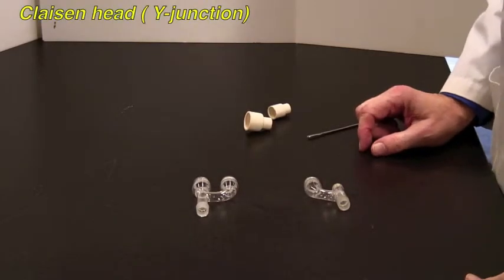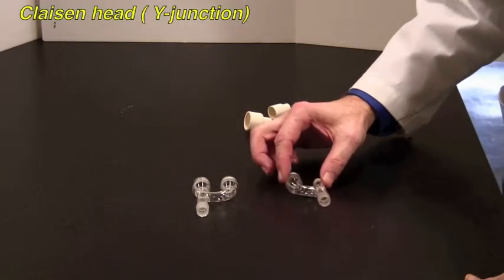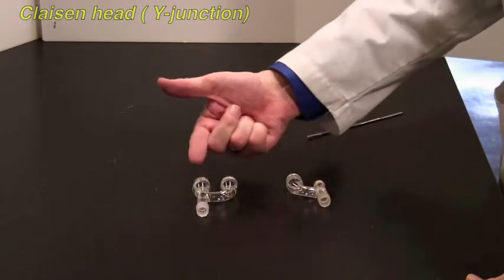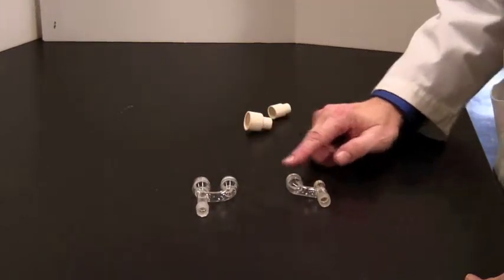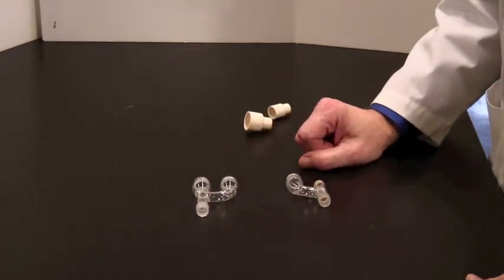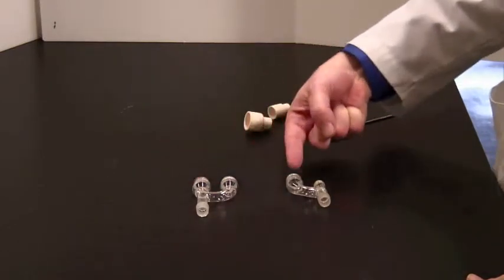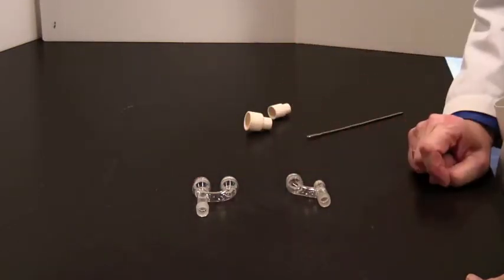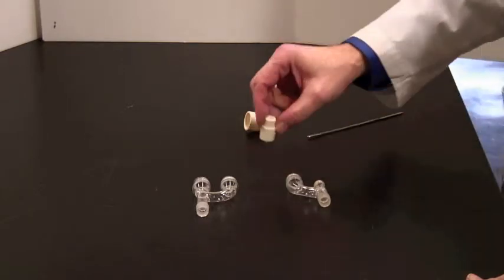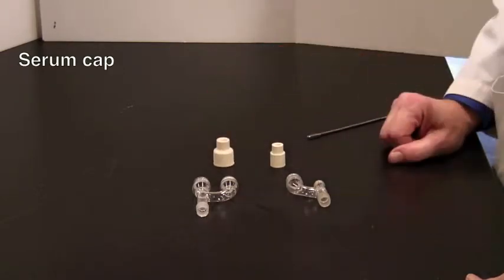You will also need a Claisen head. A Claisen head is a Y adapter, so it allows two channels into one. We have two different styles. It doesn't matter which one you have. One of them has two ground glass joints. The other one has only one ground glass joint and a threaded joint.